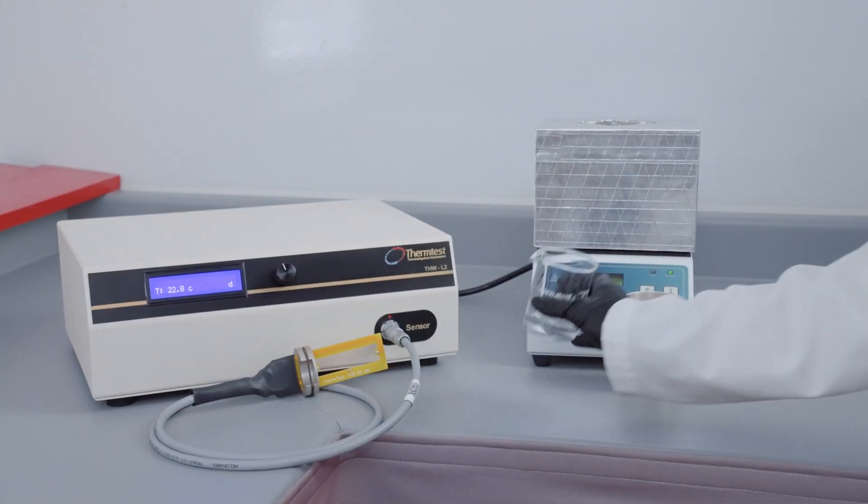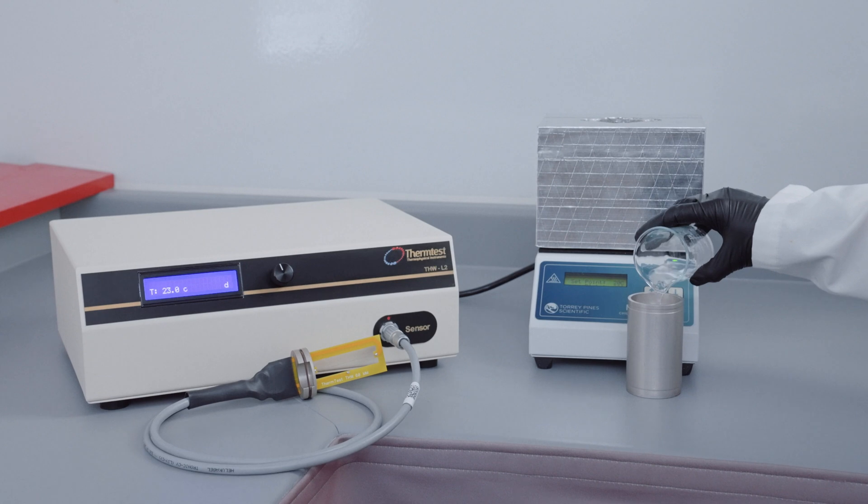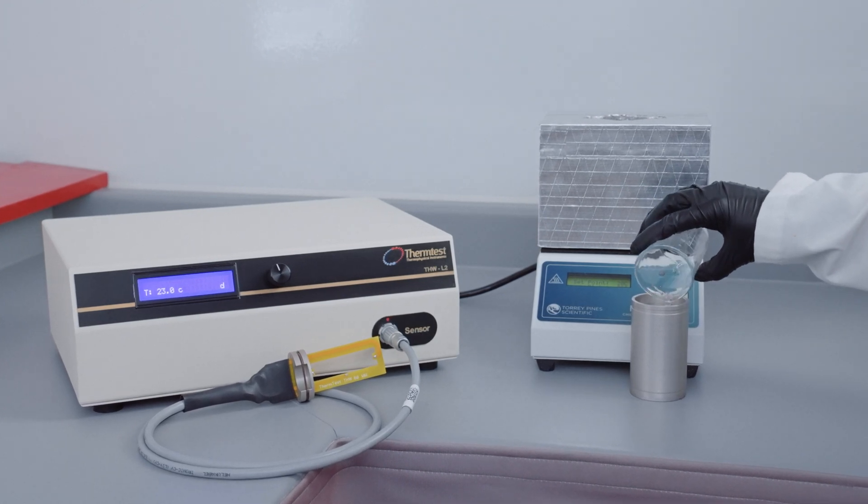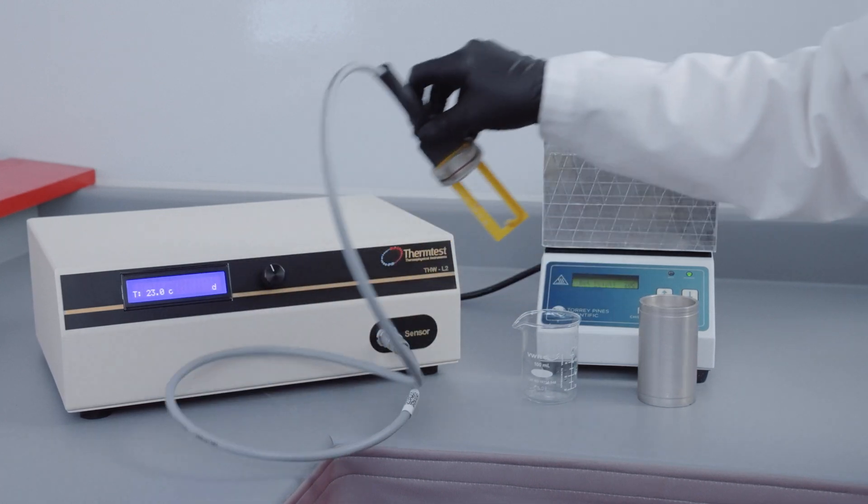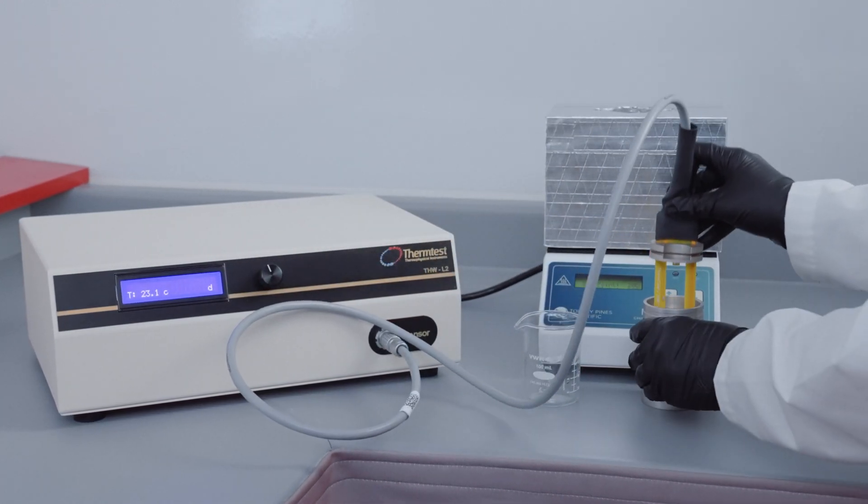With a single measurement of one second in duration, small volumes of liquids and pastes can be accurately and precisely measured for thermal conductivity.